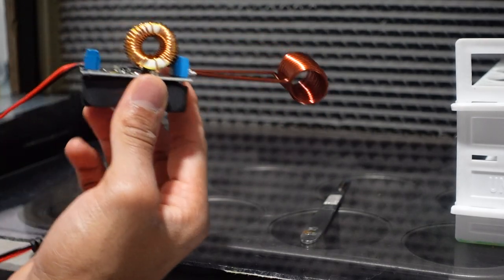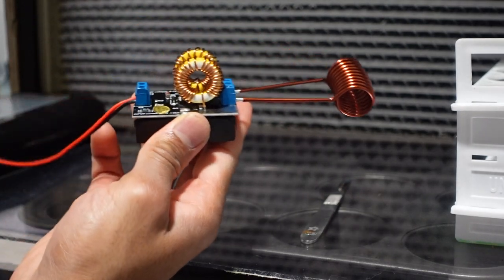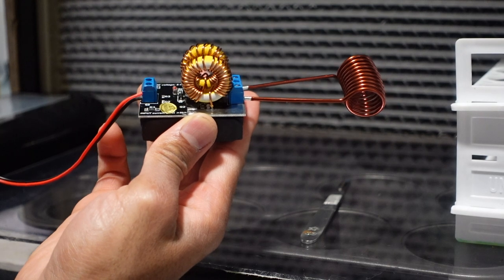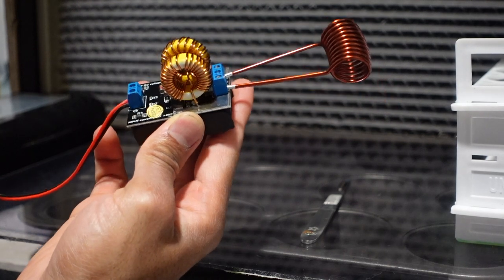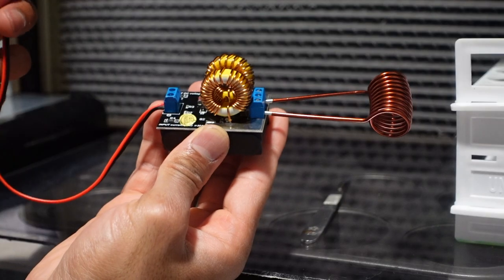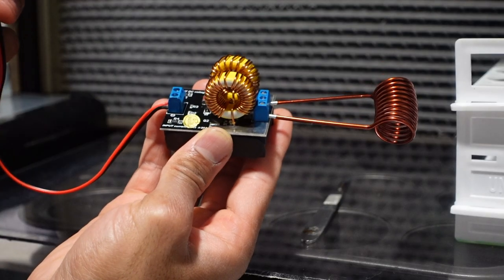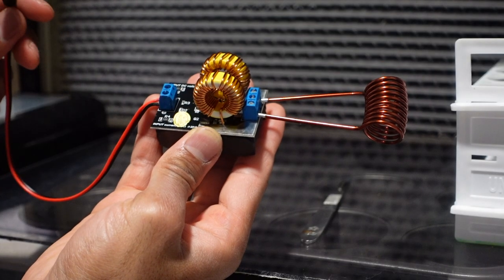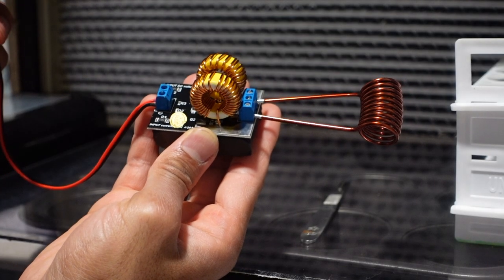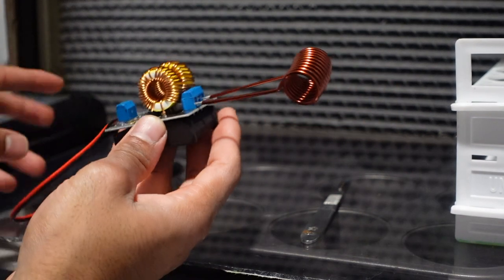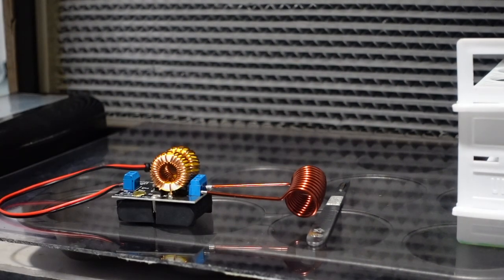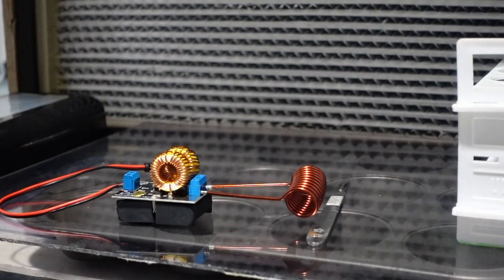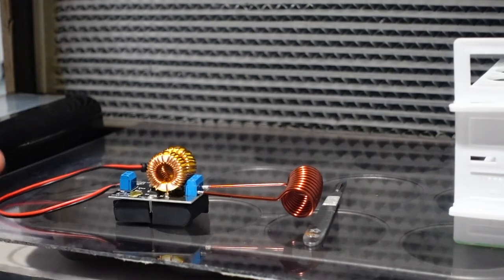Next, you will need some sort of pigtail wire, probably about 18 gauge or 20 gauge. Most of them are about the same size, about two millimeters in diameter. And next thing you will need is a 12 volt power supply.